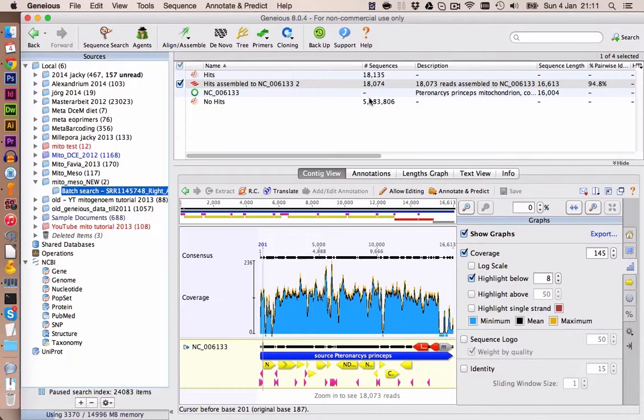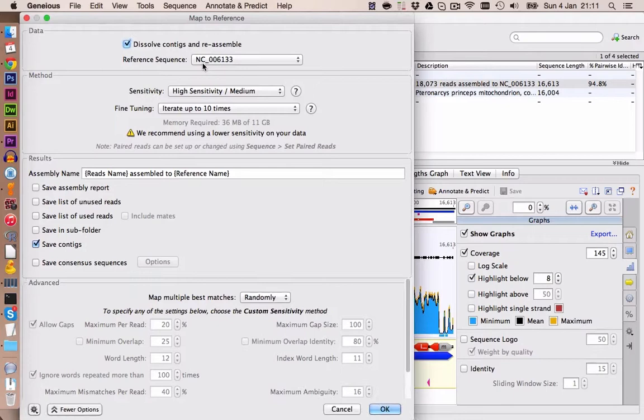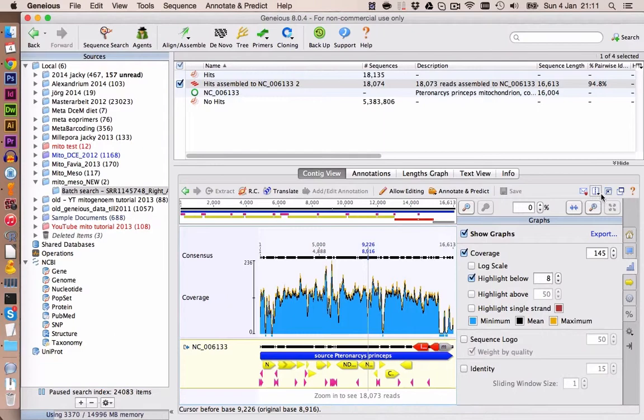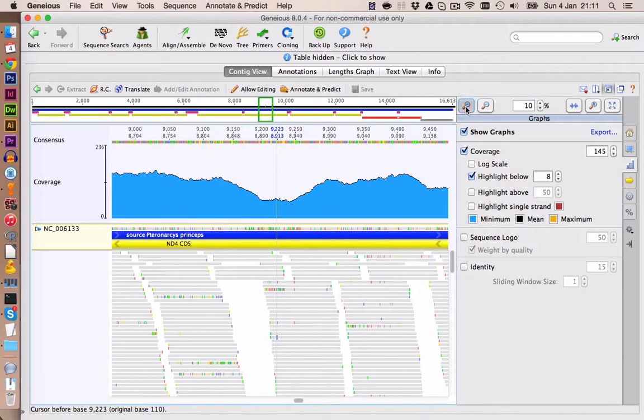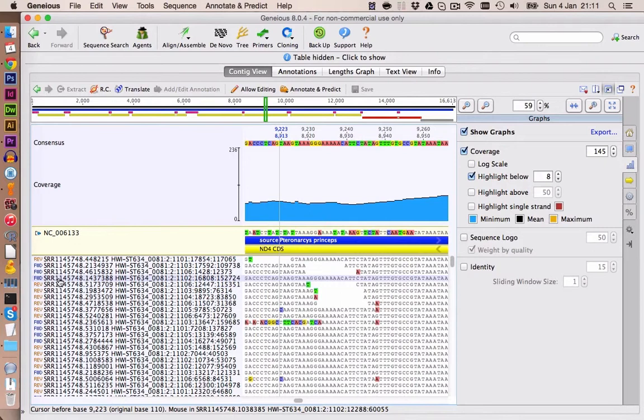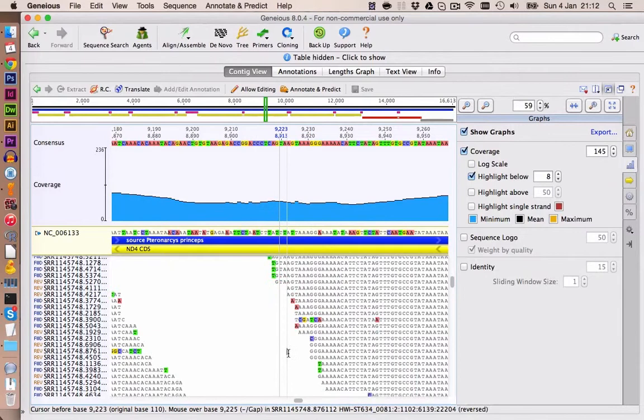We have the results here. We found 1,800 reads and I've assembled those to the reference genome of Pteronarcys. I'll also show you the settings — I used high sensitivity/medium and iterated up to 10 times. These are the results. If we zoom in, we see that the coverage is quite good, but you notice there are quite a lot of mismatches always in the first position of the read. This is a bit weird — for example, this read here is forward and has a T, which is the case for most other reads.